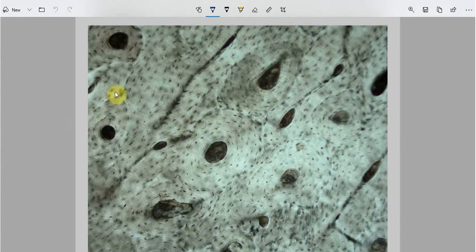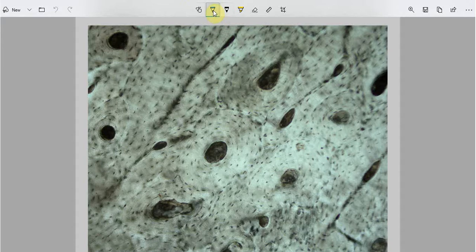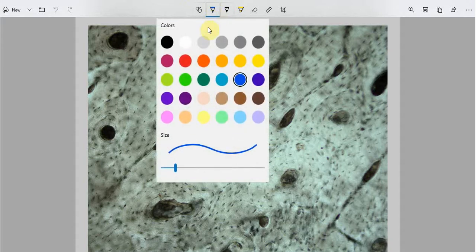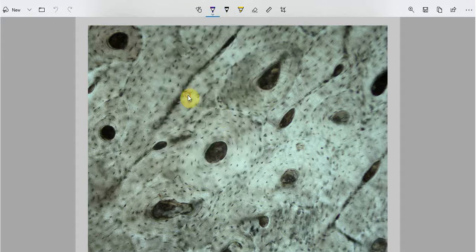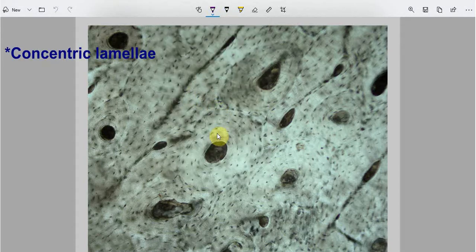There are two types of lamellae visible in this complete ground section. The lamellae or layers that are in the circular pattern are known as circumferential lamellae.